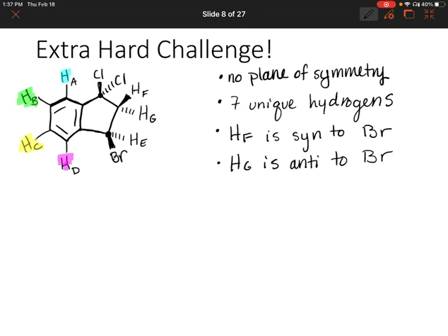All right, now there is a term for HF and HG. HF and HG are called diastereotopic protons.